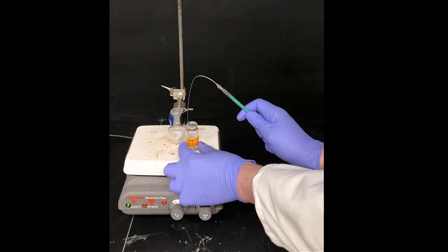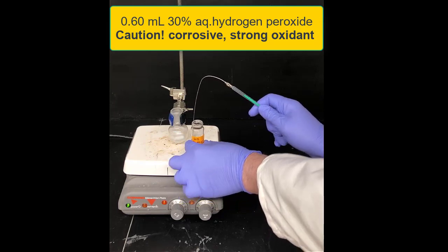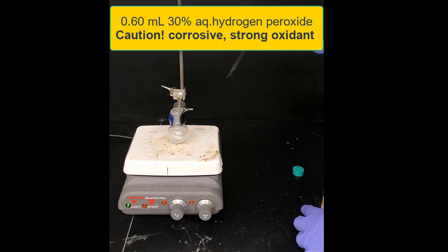Next, we'll add the 30% hydrogen peroxide. This is a reminder to use caution with this reagent because it's very corrosive and a strong oxidant. You should definitely wear gloves when you're transferring this reagent.